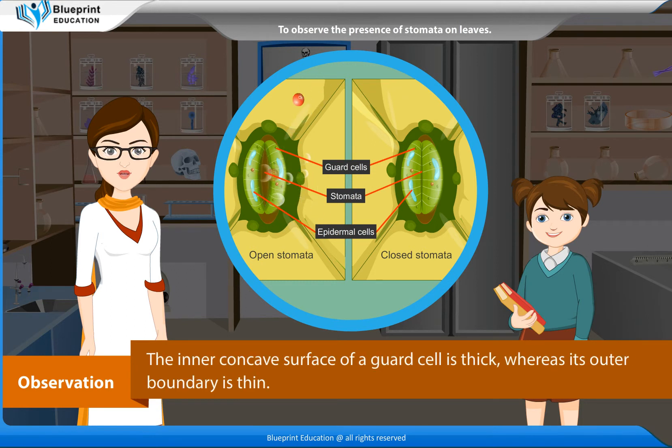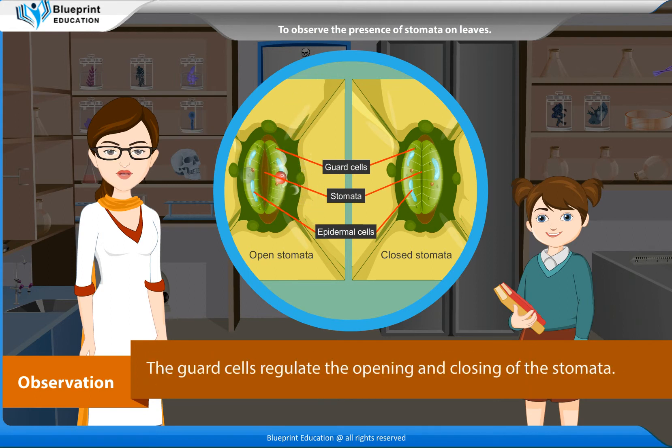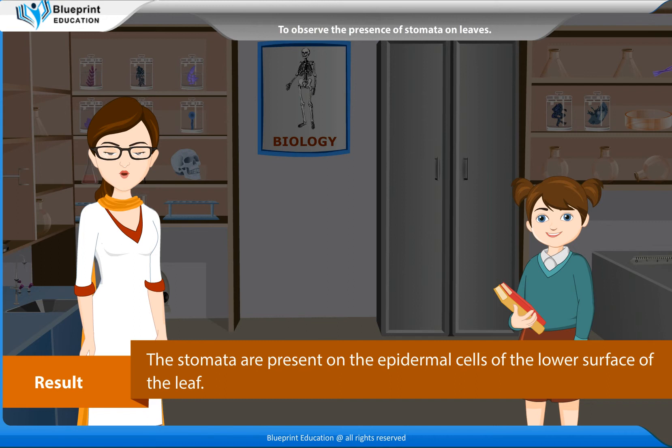The inner concave surface of a guard cell is thick, whereas its outer boundary is thin. The guard cells regulate the opening and closing of the stomata. Result: The stomata are present on the epidermal cells of the lower surface of the leaf.